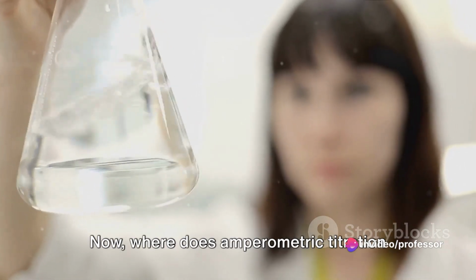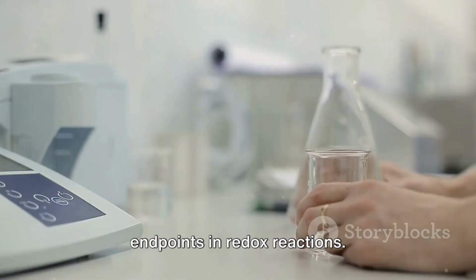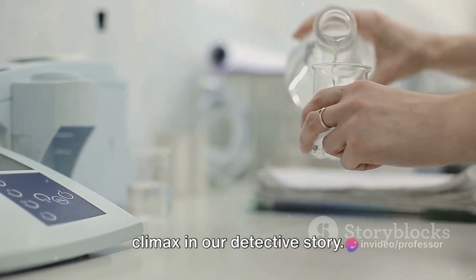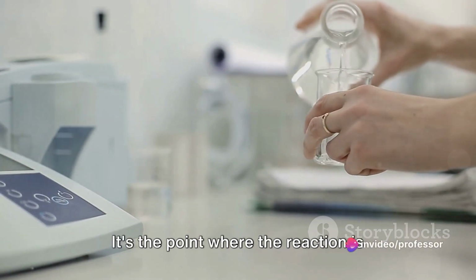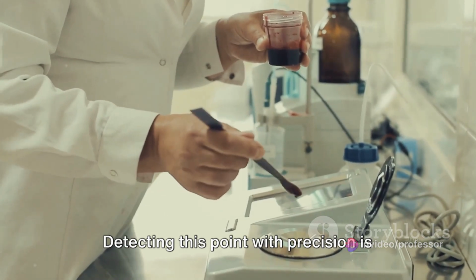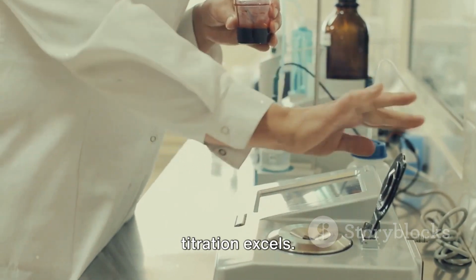Now, where does amperometric titration really shine? It's in the detection of endpoints in redox reactions. An endpoint in a titration is like the climax in our detective story. It's the point where the reaction is complete and all the secrets have been unveiled. Detecting this point with precision is crucial, and that's where amperometric titration excels.